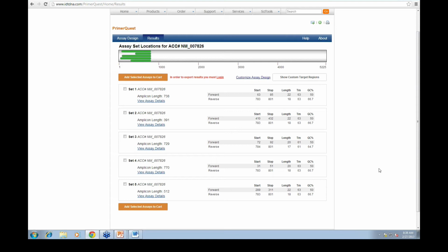One way that you could possibly do that is force the 3' end of the primer to be exactly on that SNP. As you know, if the 3' position of a primer does not bind completely, it's pretty hard for the polymerase to be able to extend off there. And so if there's a SNP exactly at that 3' end, it should significantly reduce the efficiency of your assay. Sometimes there is a possibility that amplification would occur, though.